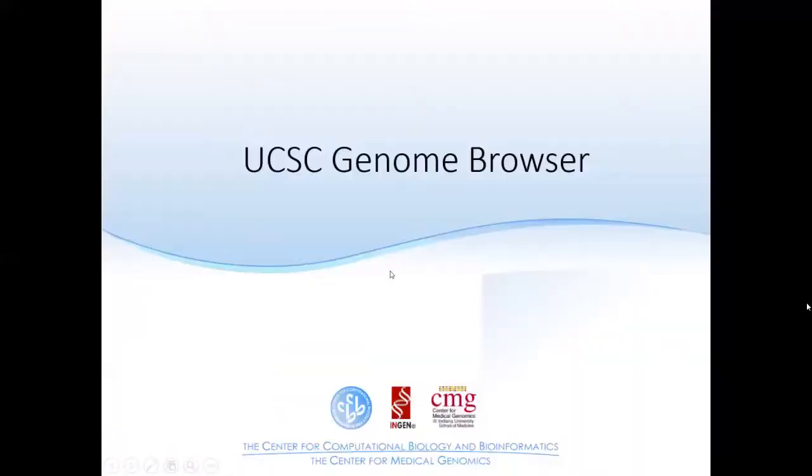That's for IGV, but IGV is very powerful. It has a lot of options. You can see them from the right-click button, and it also has the menu buttons on top. You can do a lot of things with the IGV genome browser. Another very popular genome browser is the UCSC genome browser. People use it, and our lab also uses it a lot. Let's take a look.